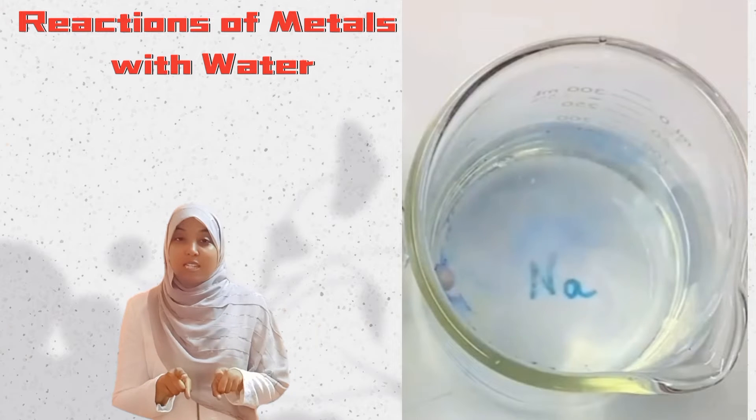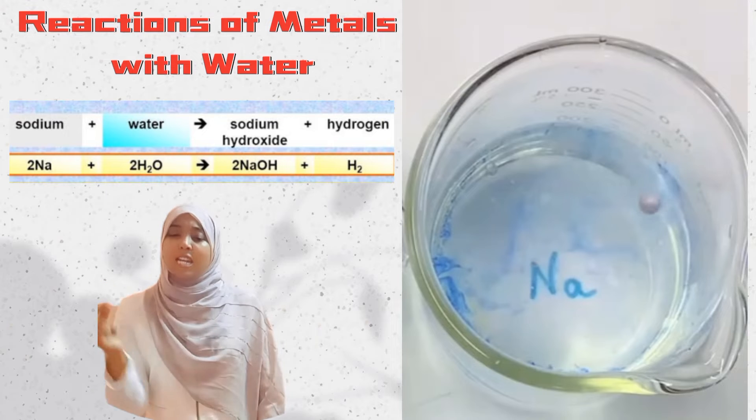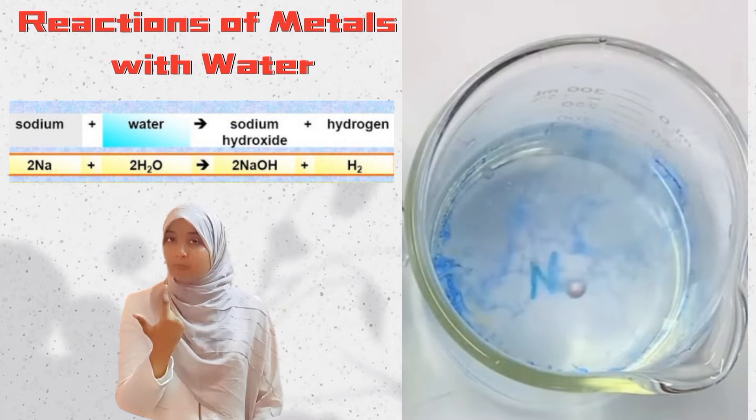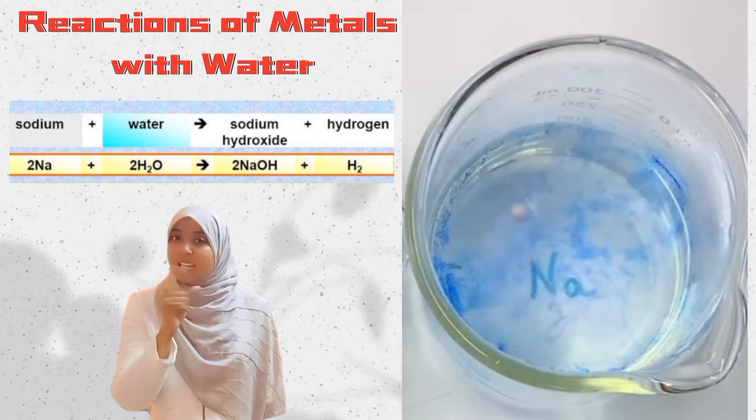Moving on to sodium. First things first: what happens to the sodium metal? It forms a silvery ball on the surface of the water. When it's on the surface, it produces a fizzing sound. Listen for it.